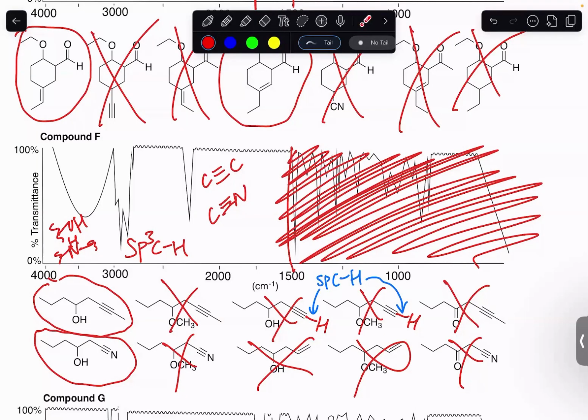If the chemical formula has a nitrogen, what would the molecule be? A or B? B. It wouldn't be this one because this molecule has no nitrogen. But because we're not given a chemical formula, we're open to either alkyne or nitrile.